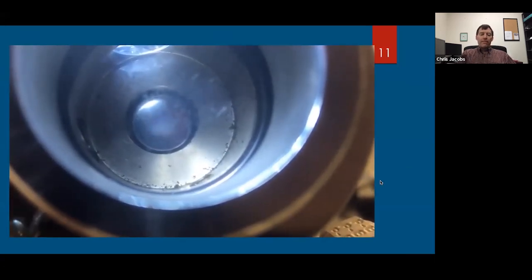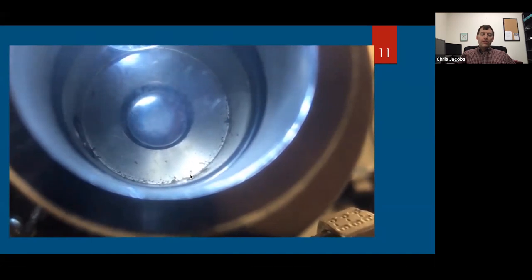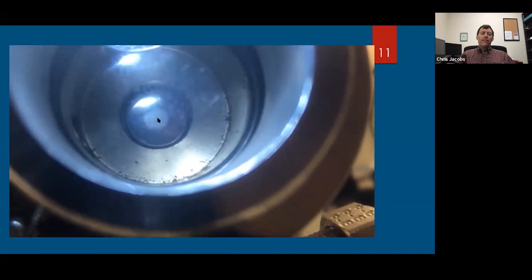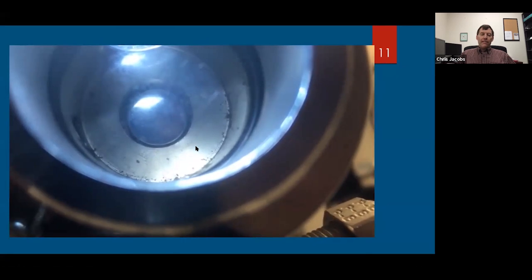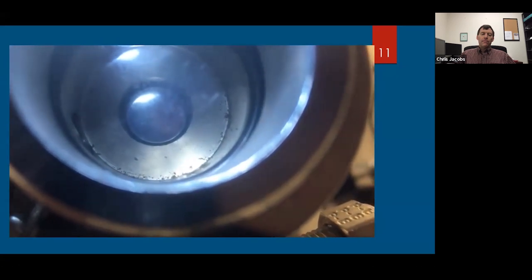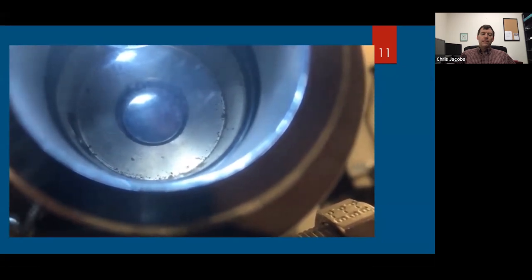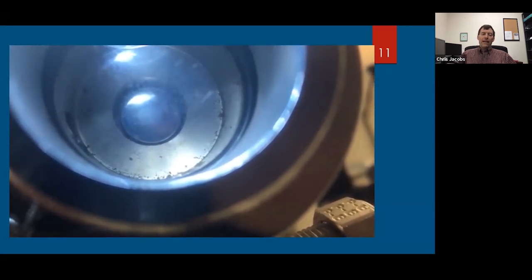Okay, see there, it just started right about in the lower part right here. Now I've turned off the chilling and I'm letting the temperature warm back up again. You can see the condensation starting to disappear. It shrinks down until it gets right about to this point here. Right about now, I would look at the temperature. Now I'm going to do it again. You just start to see a few droplets forming. So right now I look at the temperature.